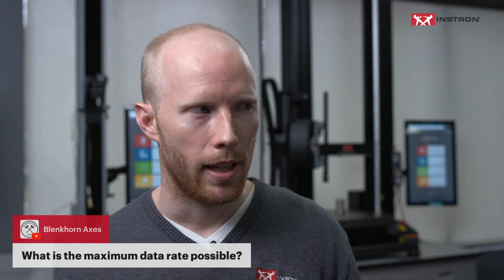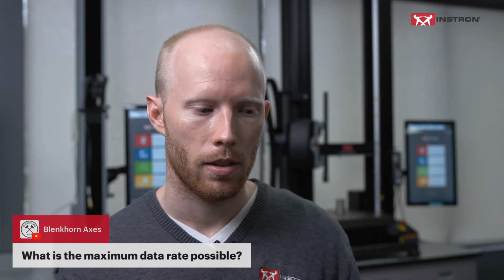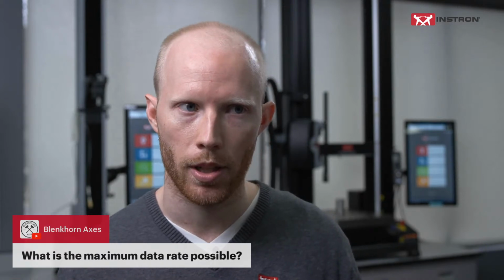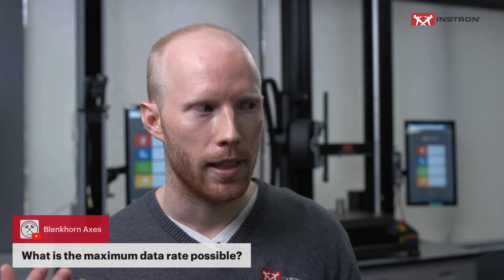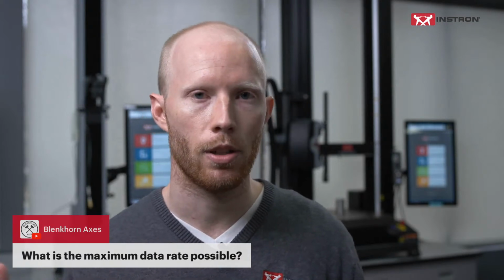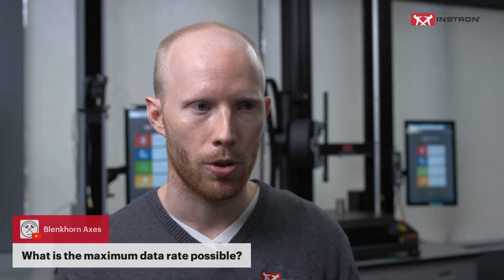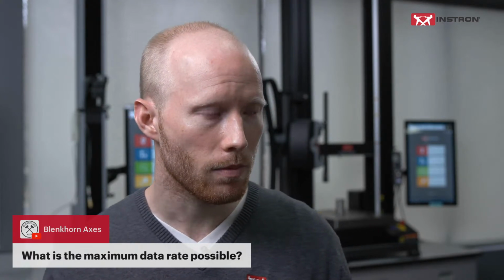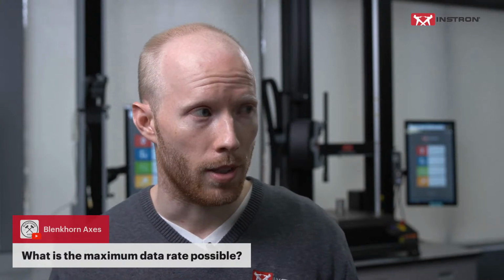But what I want to add to that is that, yes, maybe there are some situations where you want to have an incredible amount of data captured. But in reality, for 99% of applications, you do not need anywhere near that much data. You saw in the test that I'm running here, that was 1,000 points a second.